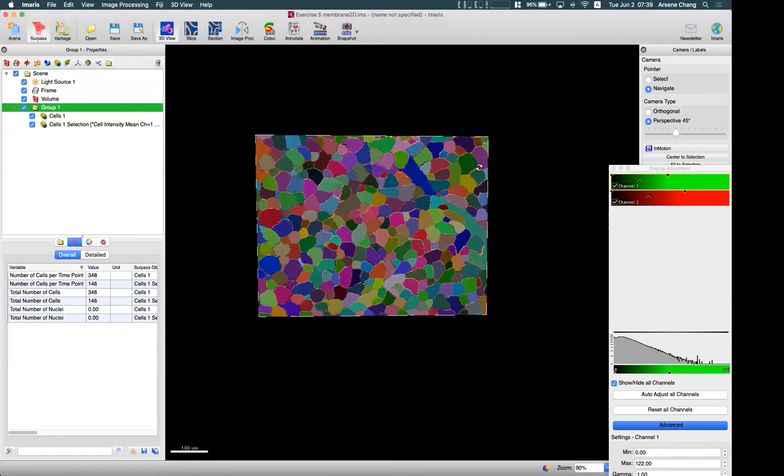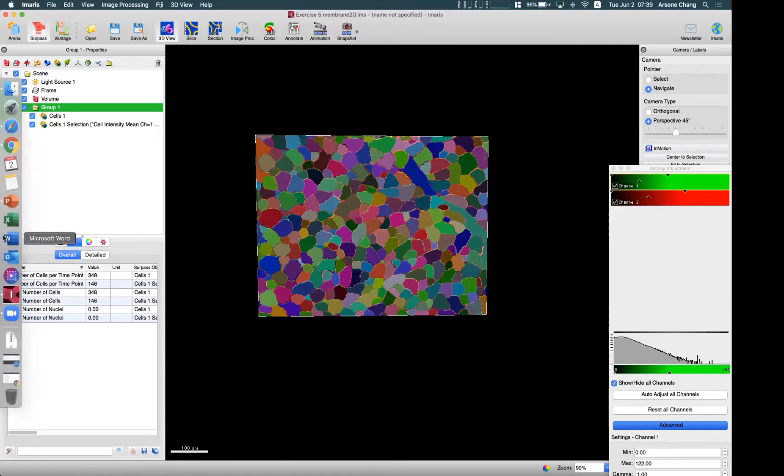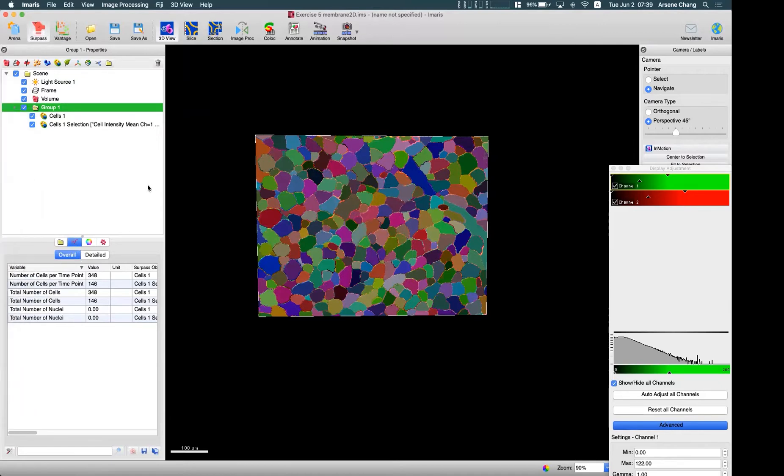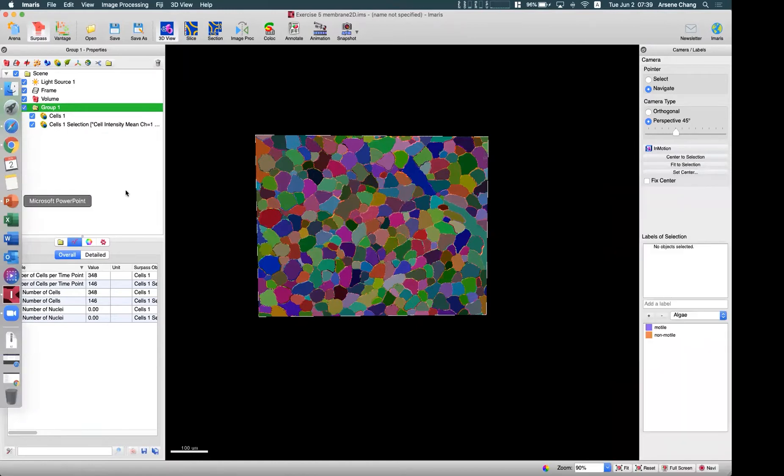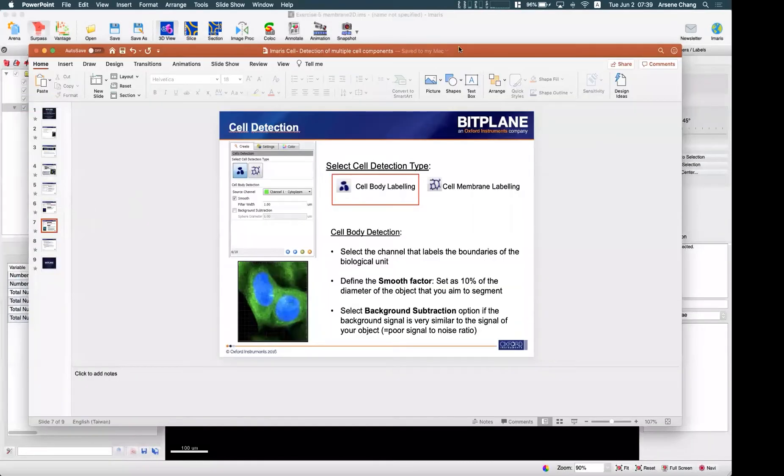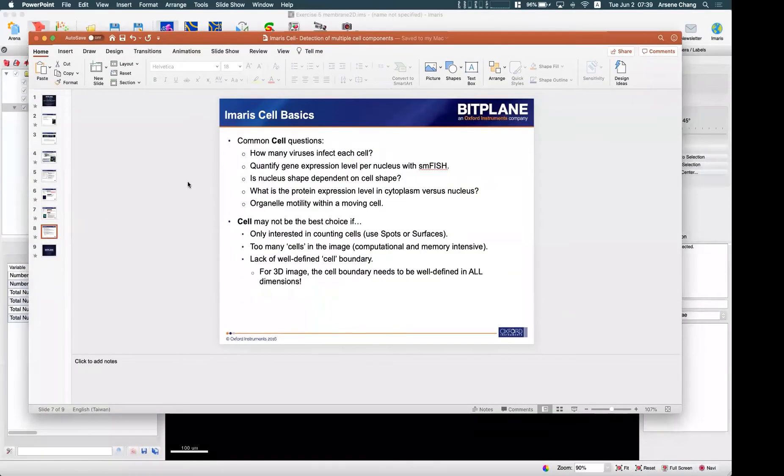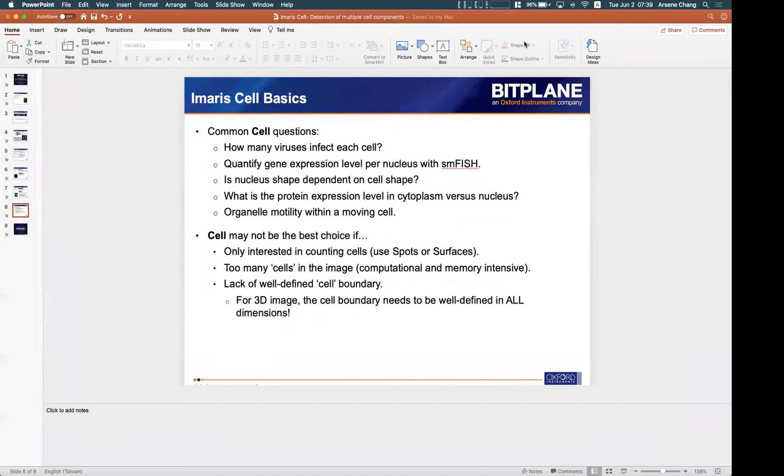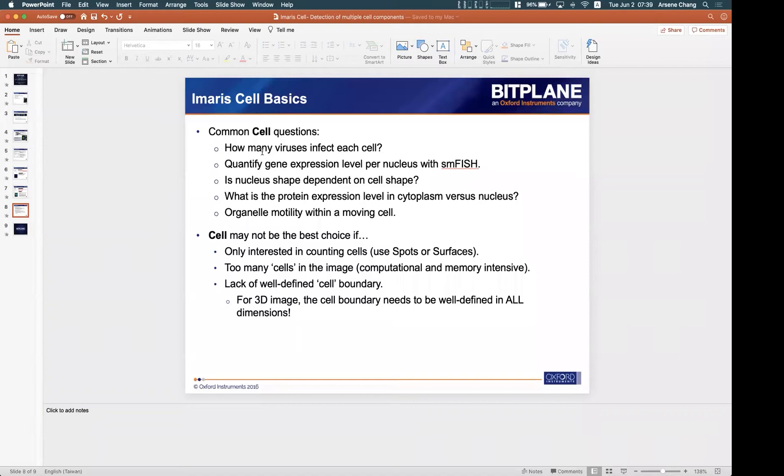Okay, so here I already went through some basic procedures in cell creation. I think it's time to understand when it's not good to use the cell modules. So here are common cell questions we can answer: How many viruses infect each cell? For example, you can use vesicle detection for the virus and cell staining for the cells, so you can easily answer how many viruses infect each cell.